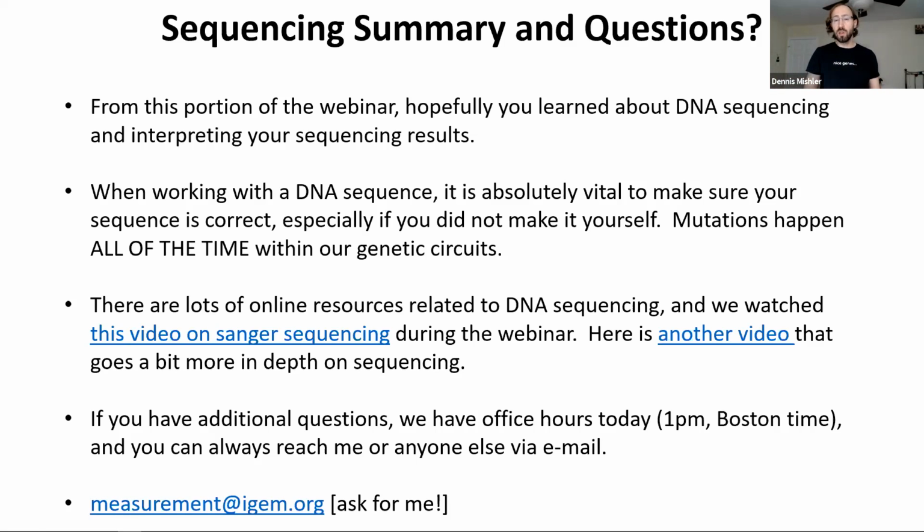Those concentrations might vary from facility to facility. So if you're working with company X, you need to see what their procedure is and follow theirs. It should be online and very clear. It's going to say, send us this many nanograms of DNA, or this many nanograms per microliter of DNA. That's going to be the main part, and then they'll tell you the primer separately.